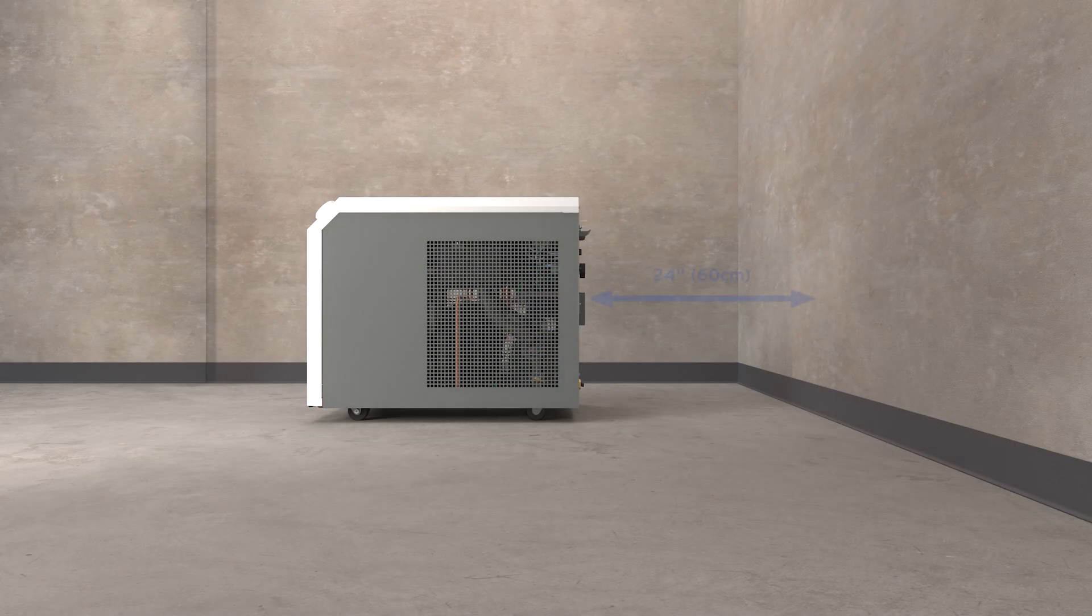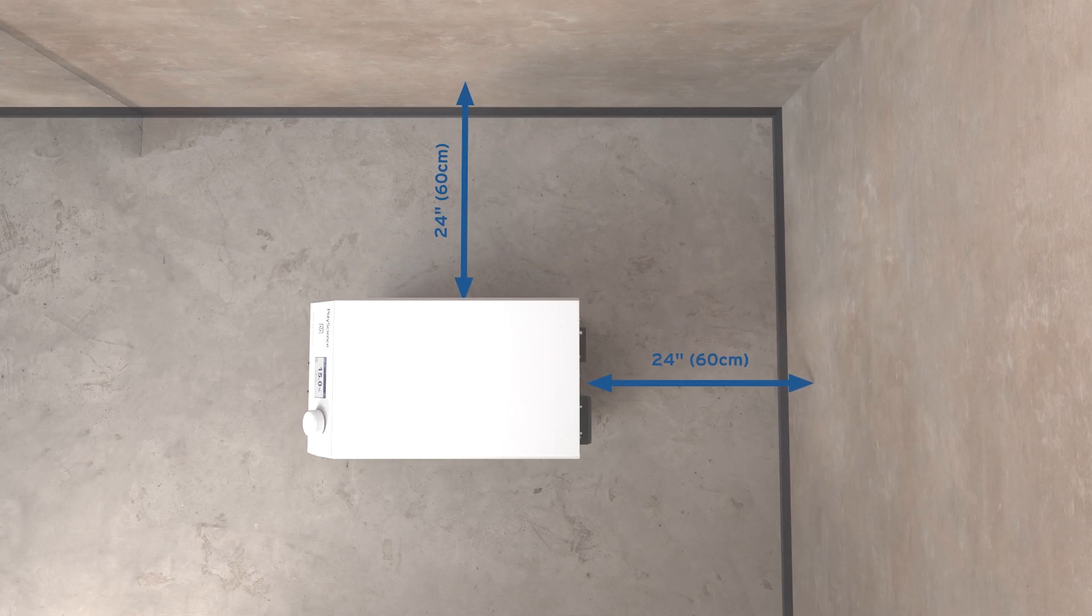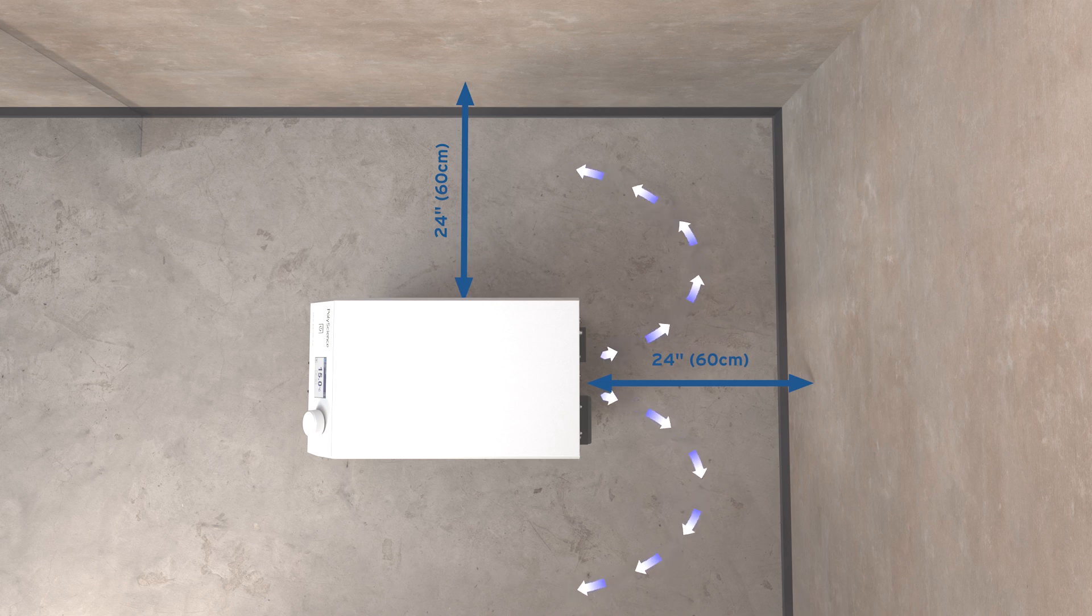Also, check to ensure that the chiller has at least 24 inches of space on all sides to ensure proper airflow.